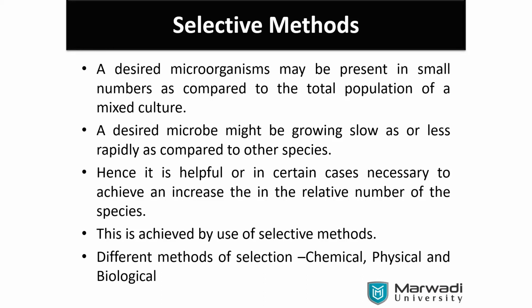You may look for the texture. Their outer boundaries, right? Outer boundaries are not round. It is very much fuzzy. Some are rhizoid. Here you can see it is like a rhizoid. The growing edge, it is like a rhizoid. So just check other different plates. You may just share with one another.